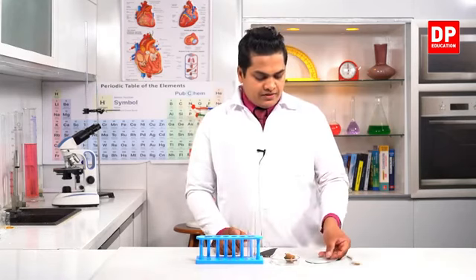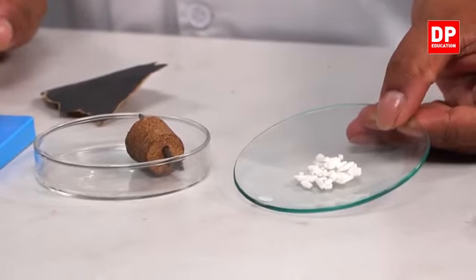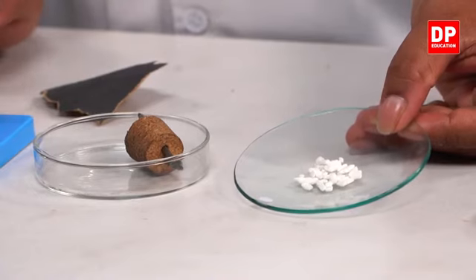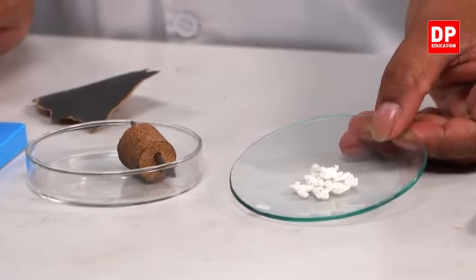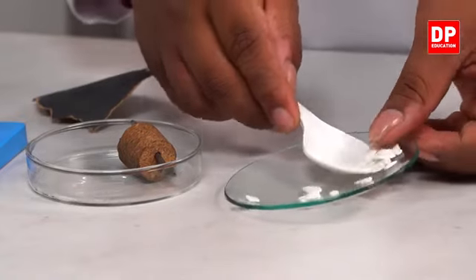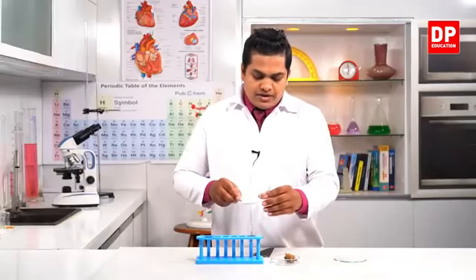Then I have with me a substance. This is called calcium chloride. This is calcium chloride crystals. The specialty in calcium chloride is that it can absorb water vapor in the atmosphere. So first of all, I'm going to use this calcium chloride and insert it into our boiling tube.